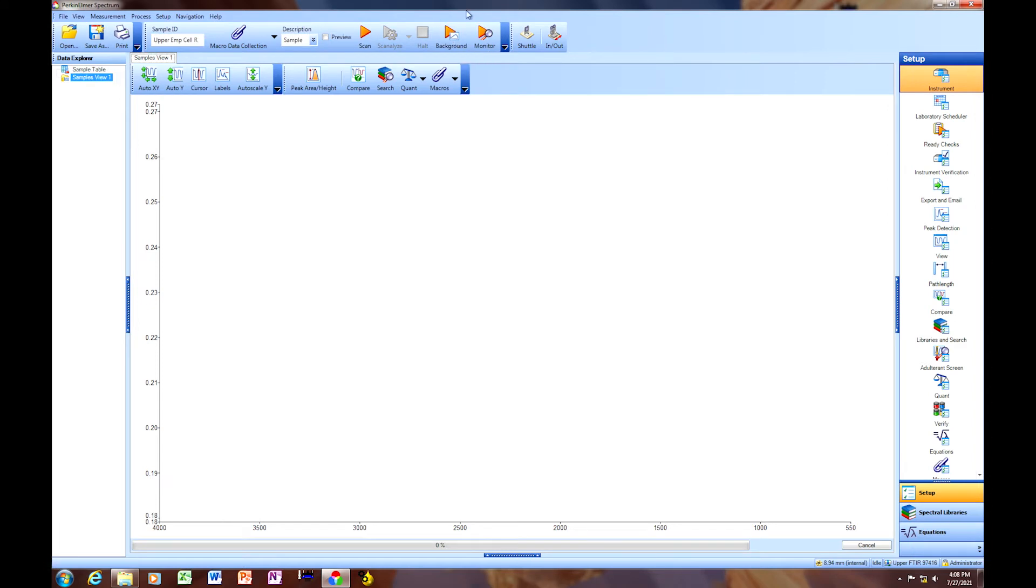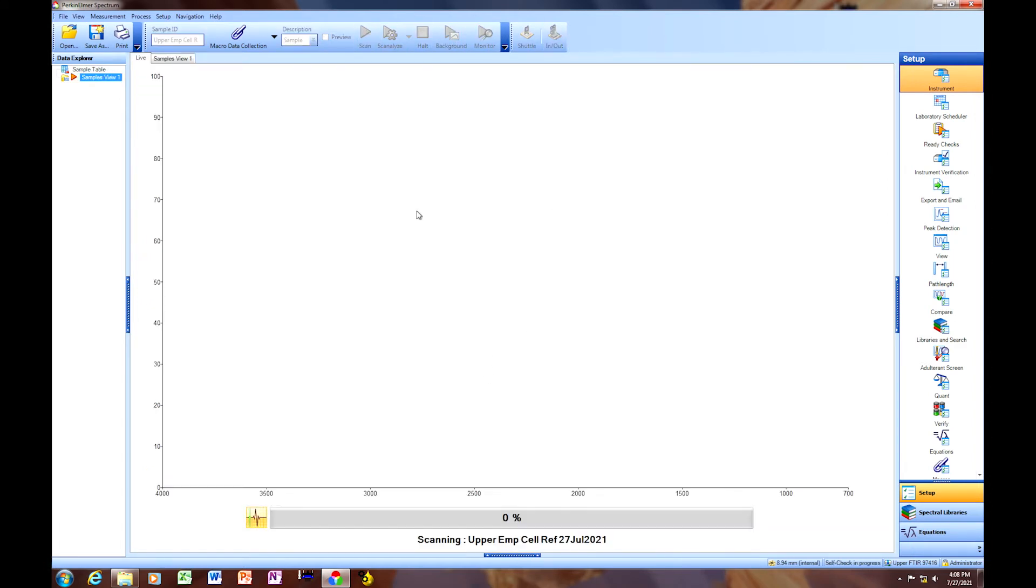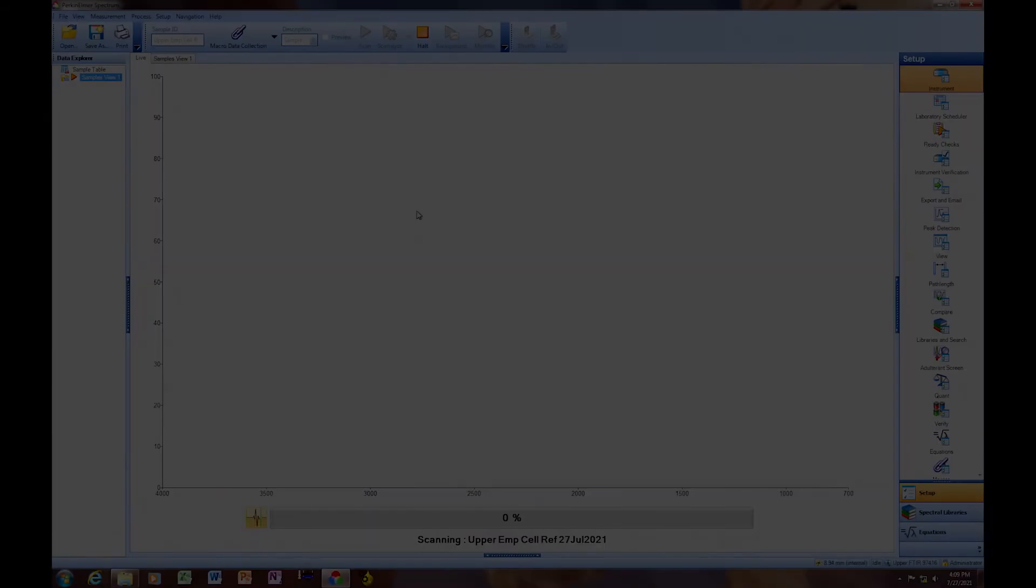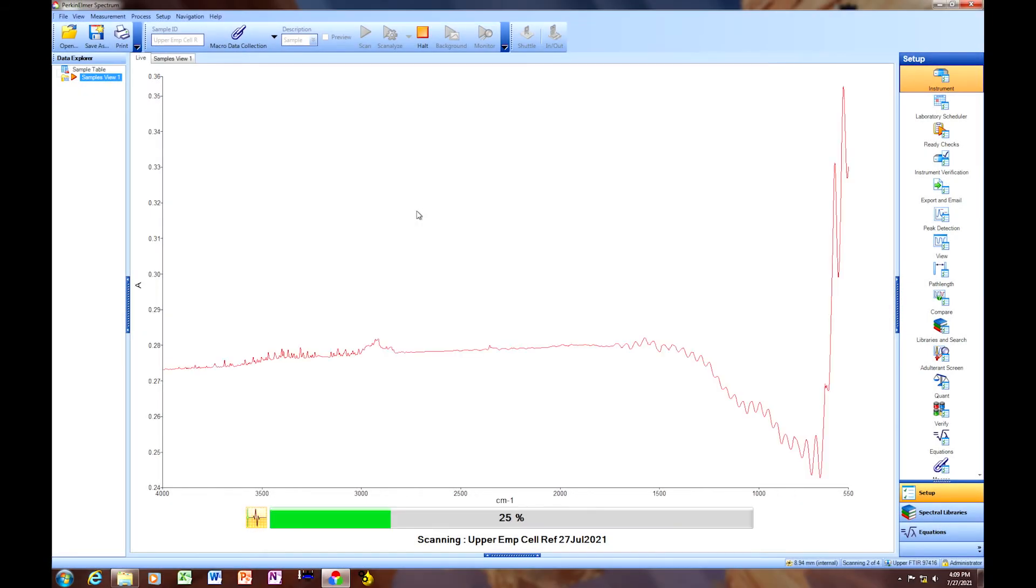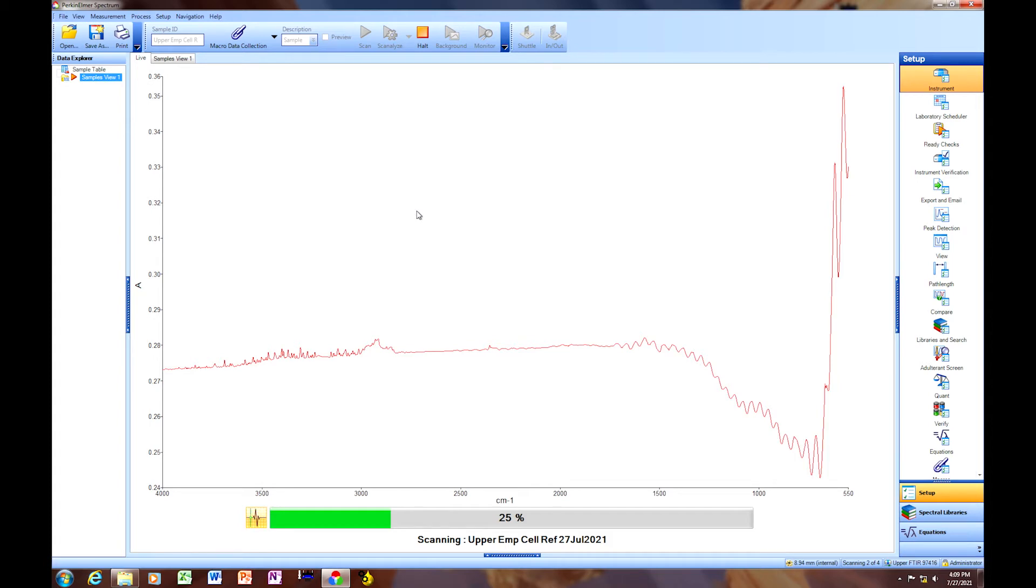Once it's finished collecting the background, we're going to click Scan. First it will collect the uncorrected version of the empty cell reference spectrum. You can see noise in the spectrum, or the fringing from the window reflection. And the baseline will be slightly different than the corrected version.